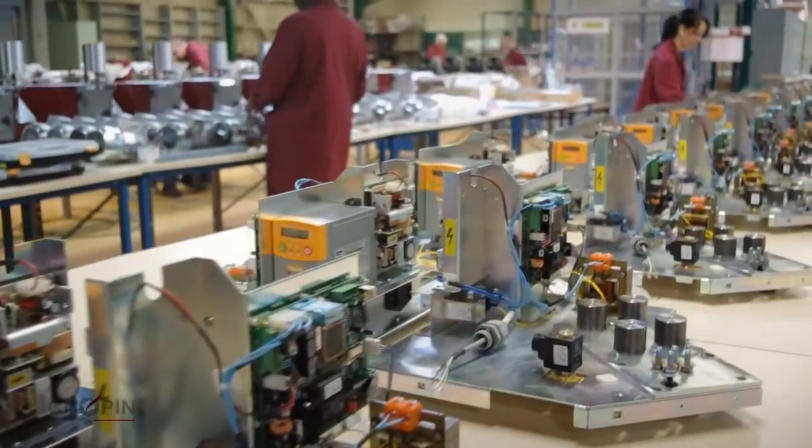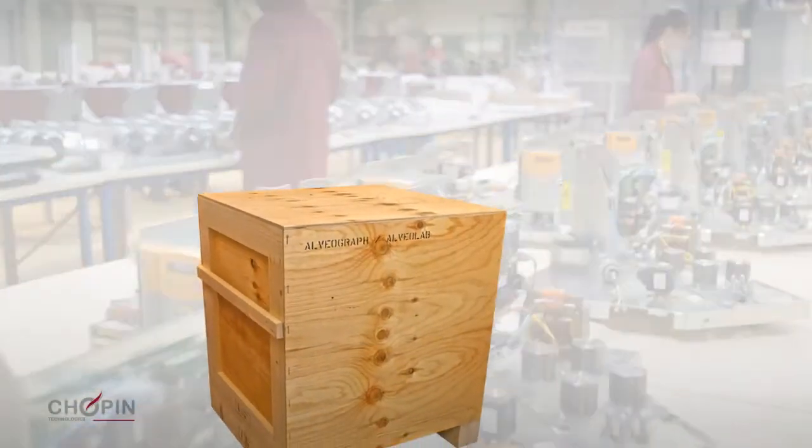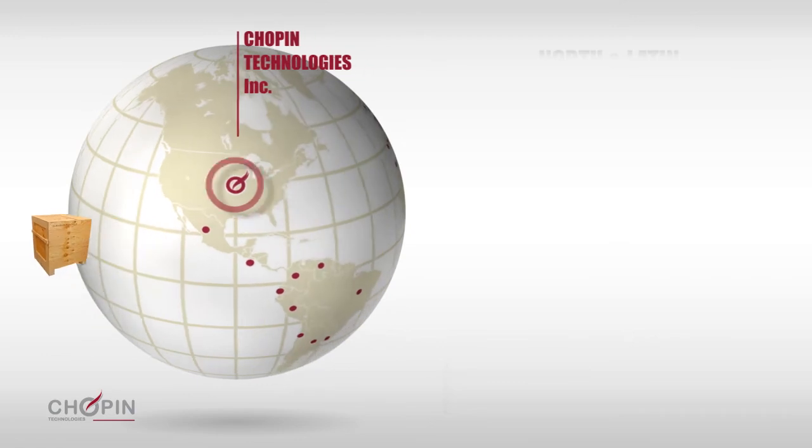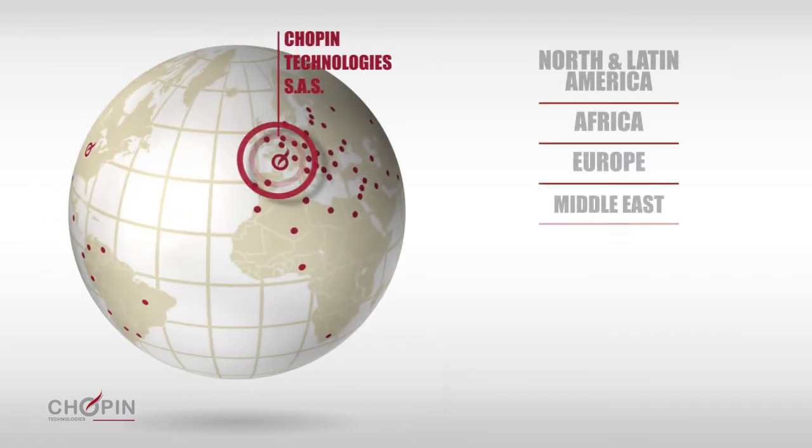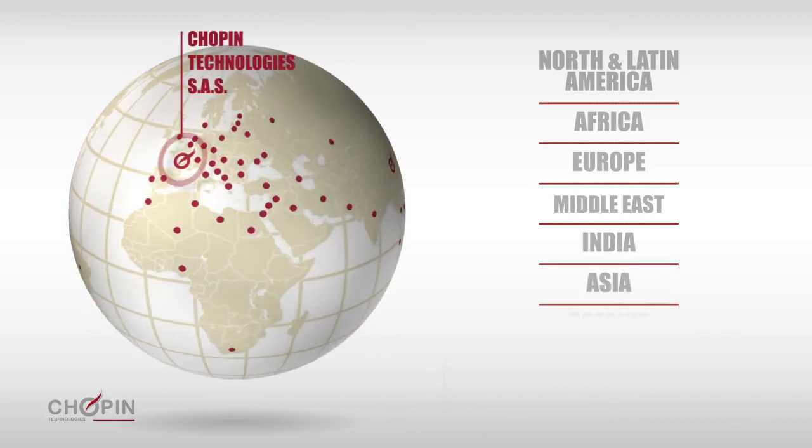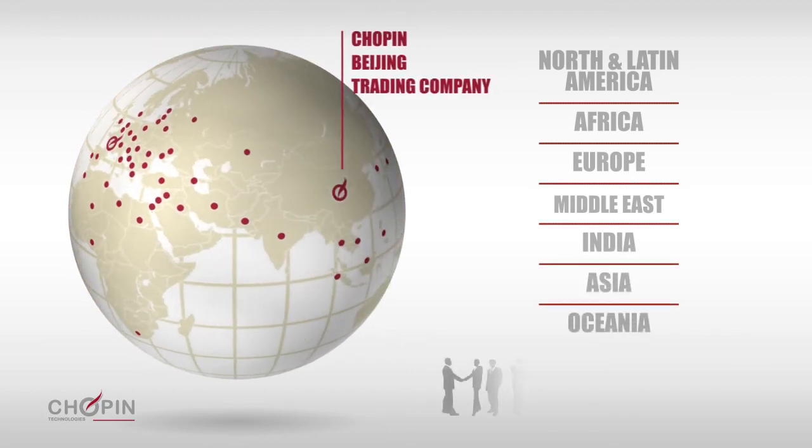Made in France, the Alveograph has a customer base in over 90 countries. All across the world, technicians are available to train users, carry out maintenance and support equipment, and provide a rapid response to ensure quality analysis.